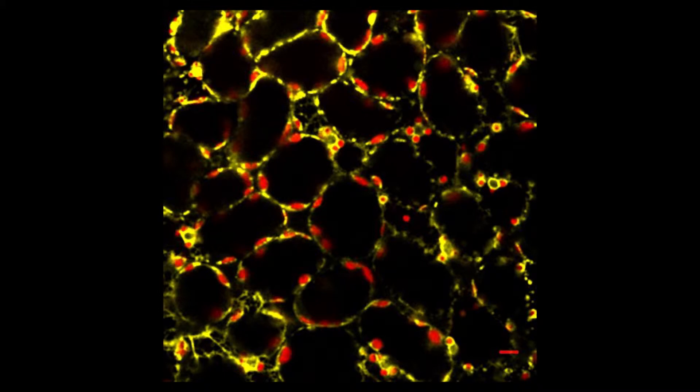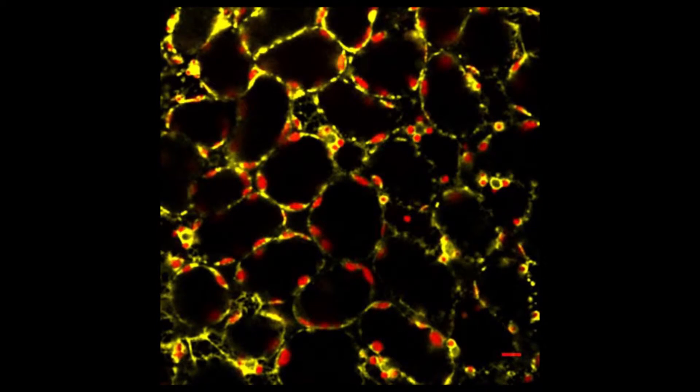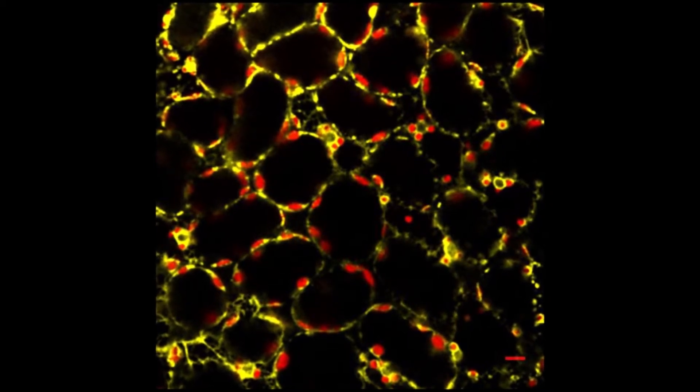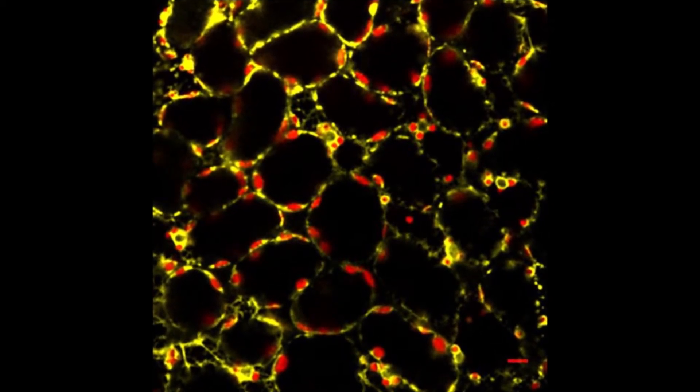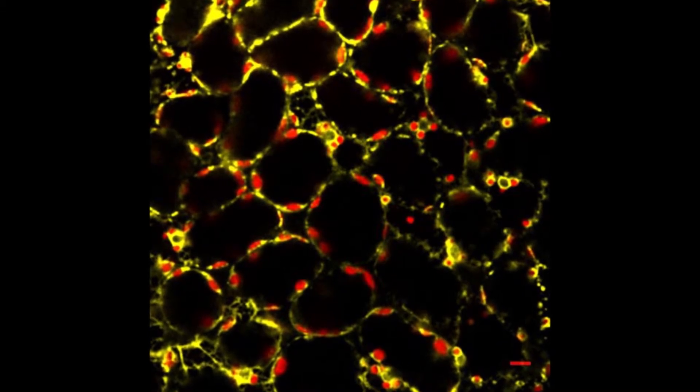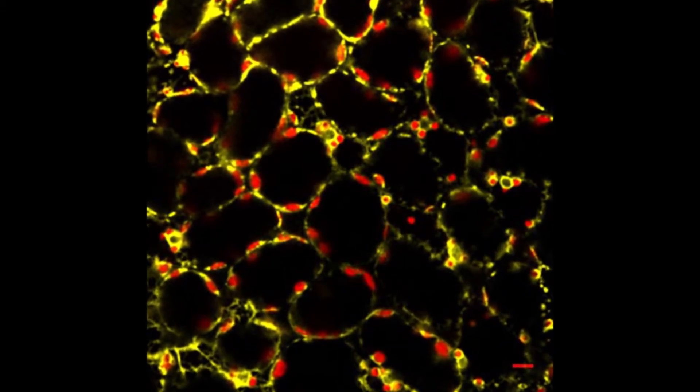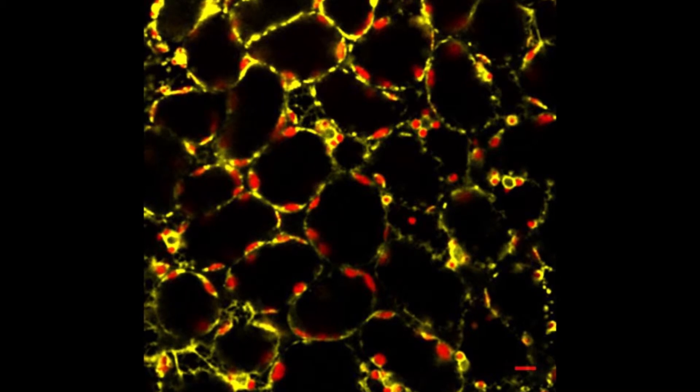Here is one of the leaf cells of Arabidopsis. The endoplasmic reticulum is again labeled with yellow fluorescent protein. The chloroplasts are labeled with cyan fluorescent protein. It shows how the endoplasmic reticulum forms baskets around the chloroplast near the cell membrane.